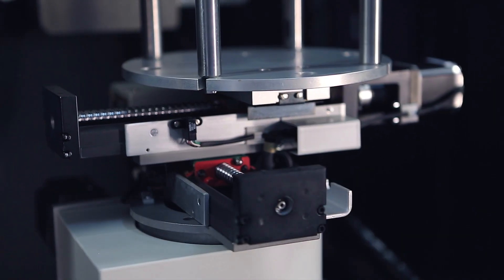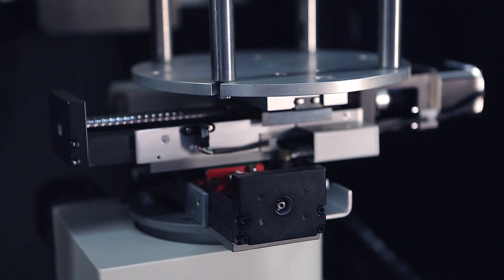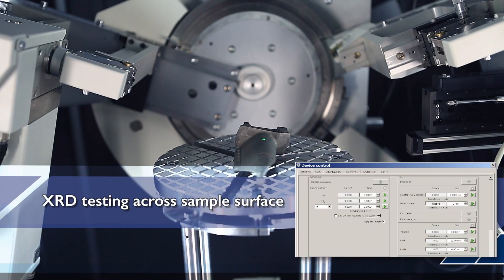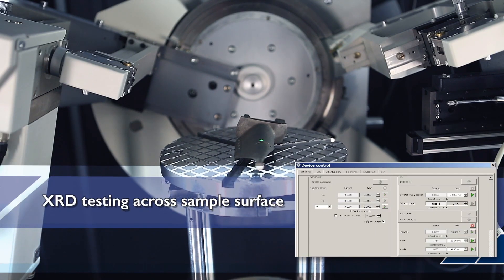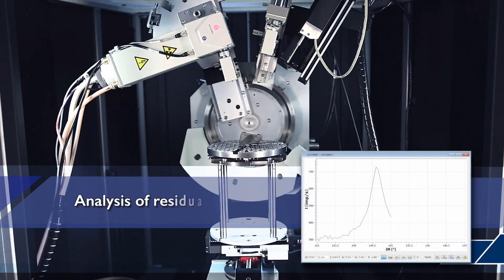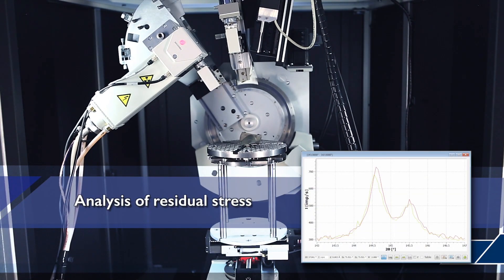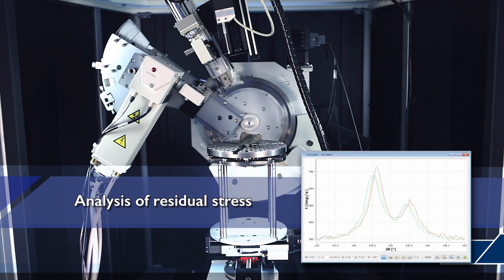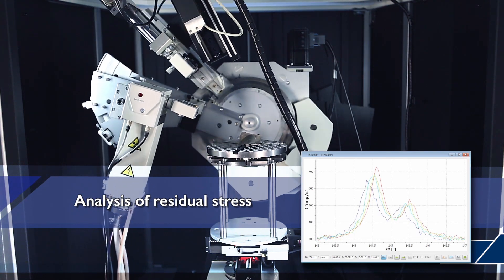Two automatic carriages of the sample holder move the required area into the X-ray beam to perform testing across sample surface. For example, one can analyze residual stresses in different points of a turbine blade.